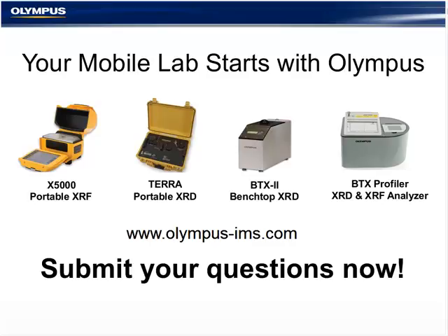And traditional XRD labs are absolutely necessary for certain applications. They're absolutely necessary for studying true clay speciation and measuring clay expandability. Field XRD will quantitate the amounts of particular clay minerals, but if you have samples you're especially interested in, especially with their discrete clay properties, this is a great opportunity to screen through the bulk of your well and then send those to a traditional core analysis laboratory and also get your results back from them a lot faster.